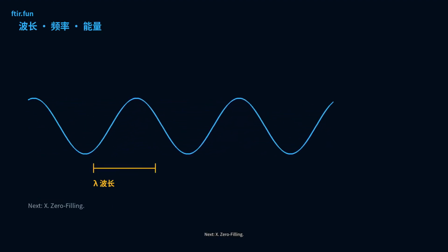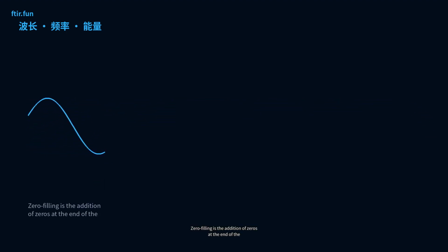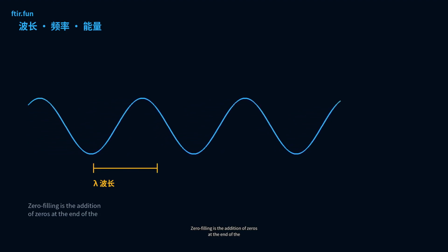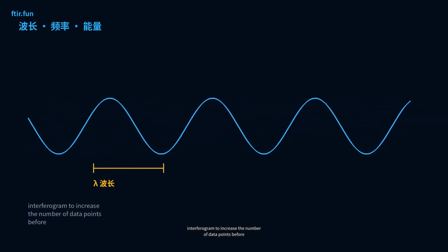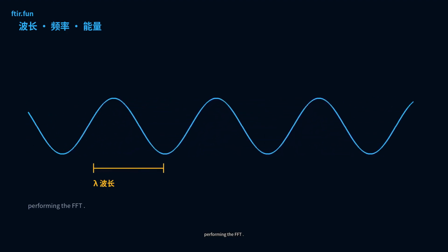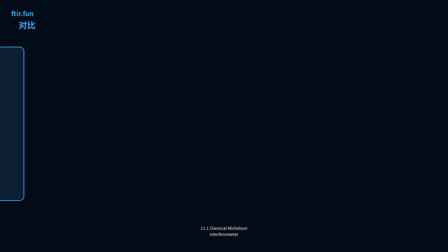Next, zero filling. 10.1 What is zero filling? Zero filling is the addition of zeros at the end of the interferogram to increase the number of data points before performing the FFT. Next, evolution of interferometer design.